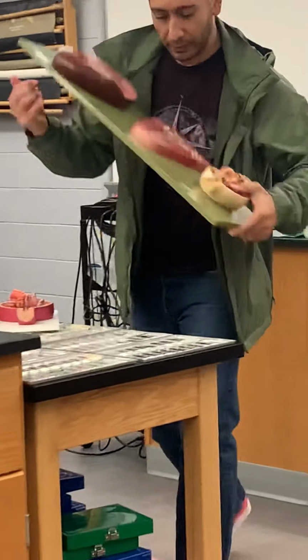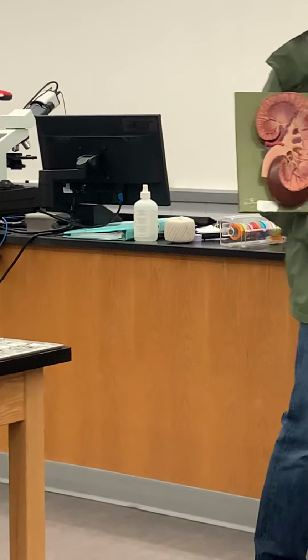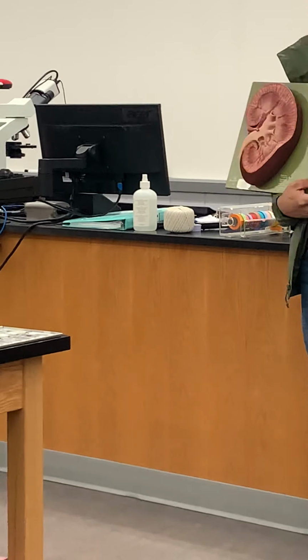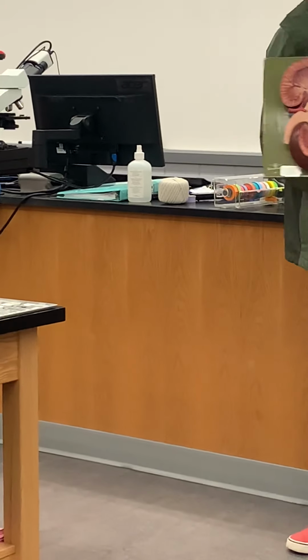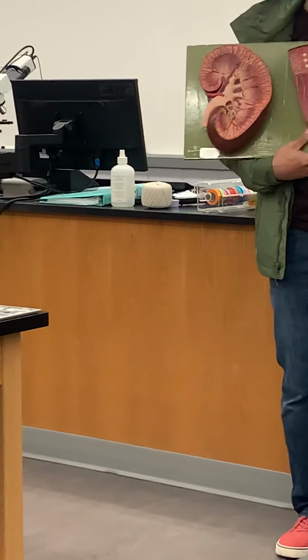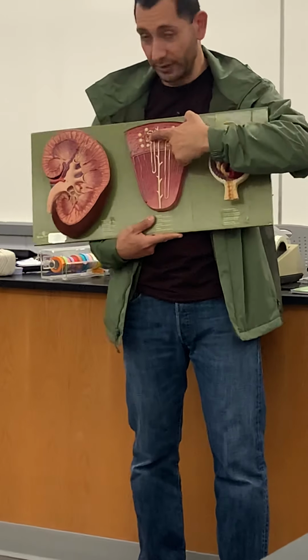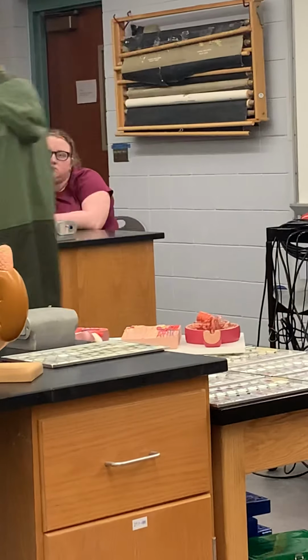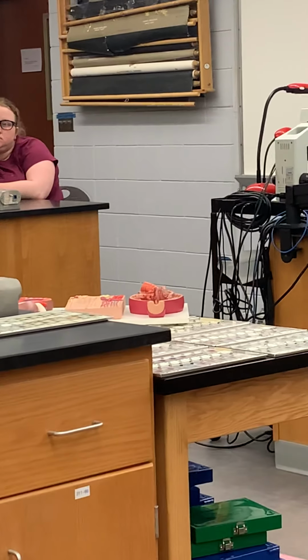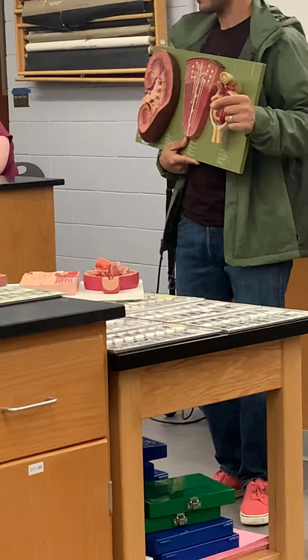Also, just pay attention to where your renal corpuscle is, because if it's here, then all the way on your right is the PCT. See, this one starts left. So make sure you always start with the renal corpuscle, then follow from there. Okay, guys?